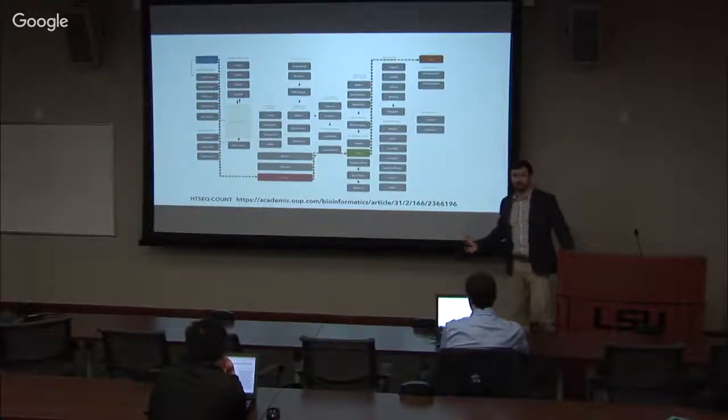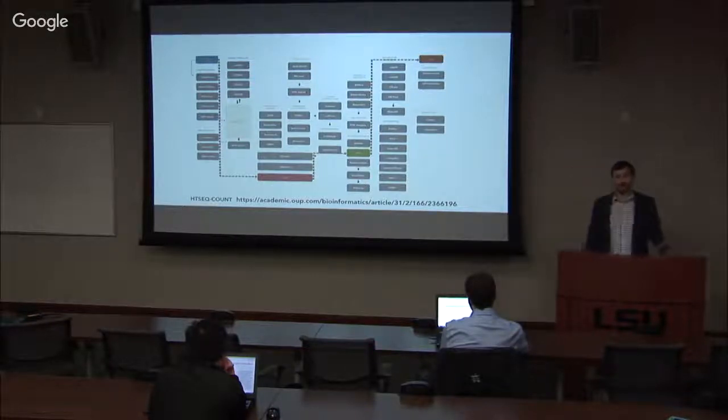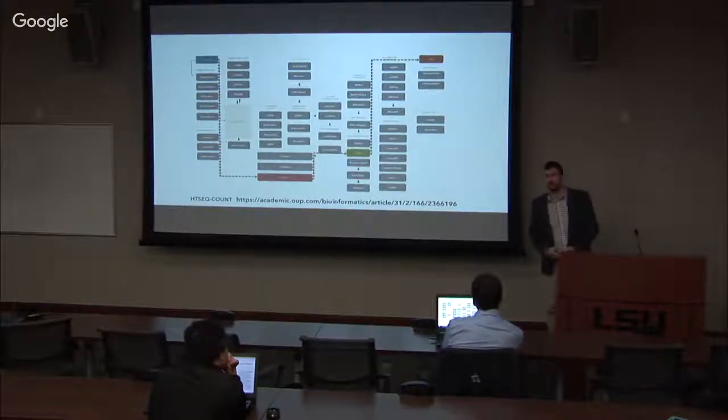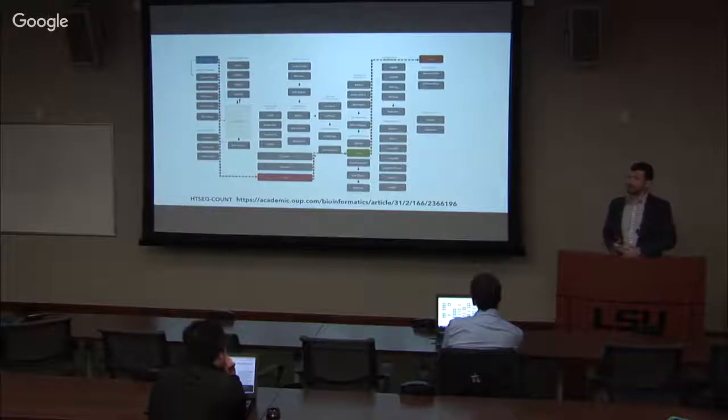So those two approaches, just important to know that the quality in the end is going to be very comparable, specifically for genes and known isoforms. In some cases, people report that it's not as accurate for non-coding RNA. So if you don't have poly-A, if you have total RNA sequencing, and you're looking for additional information that is beyond genes and isoforms, you might want to consider not using these methods. But if you're looking for speed and efficiency, this would be the way to go.